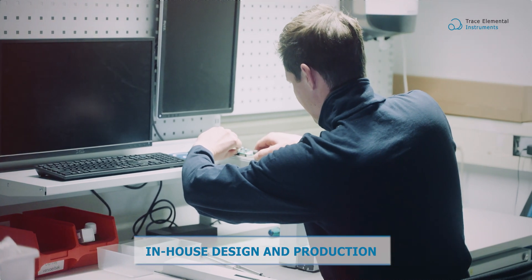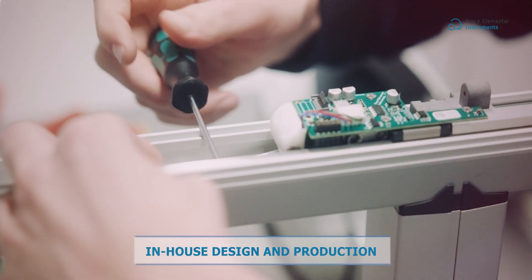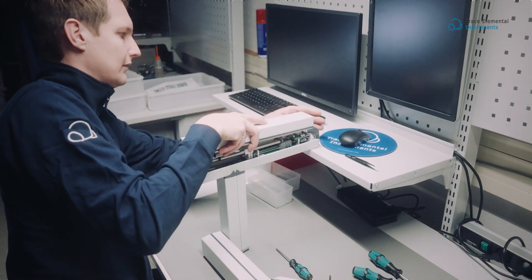Proudly designed and produced in-house by TE Instruments, ensuring quality and innovation at every step.